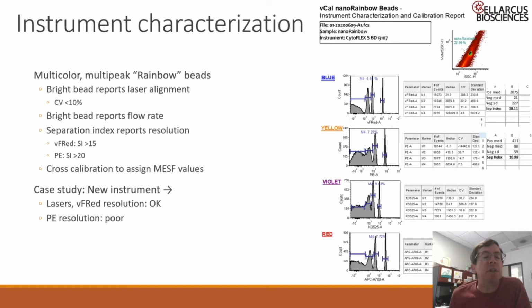So PE, which is probably the best, brightest immunofluorescent stain for immunofluorescence of EVs, we can set a threshold there. These fluorescence beads can be cross-calibrated against MESF standards so that we can report our brightnesses in those values.